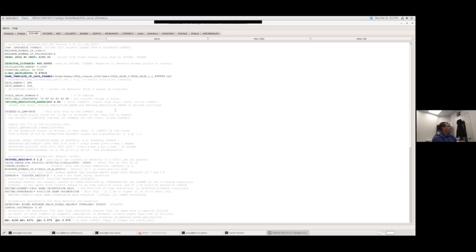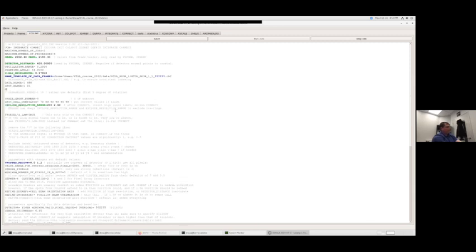I might do 10 images. So I can say spot range of 1 to 10, and then I can put in a second spot range, say, I don't know, maybe 301 to 310. And it will take those as spot ranges and just pick spots on those and then use that for indexing.